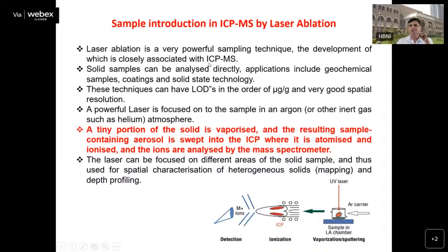So laser ablation is a powerful sampling technique in which a solid sample can be analyzed directly, and applications include geochemical samples, coatings, and solid state technologies. And what are the advantages of this? The LODs are in the order of micrograms per gram, and it has very good spatial resolution.